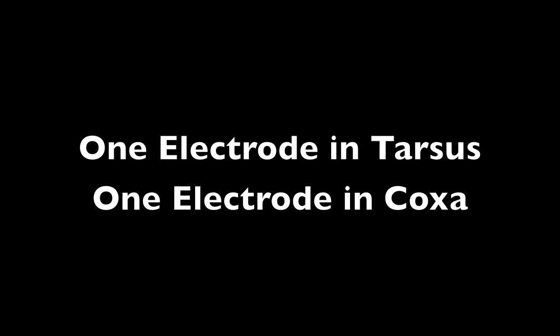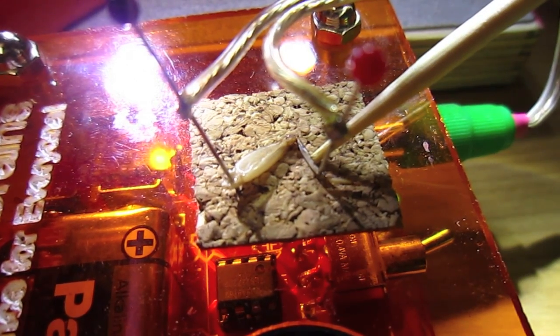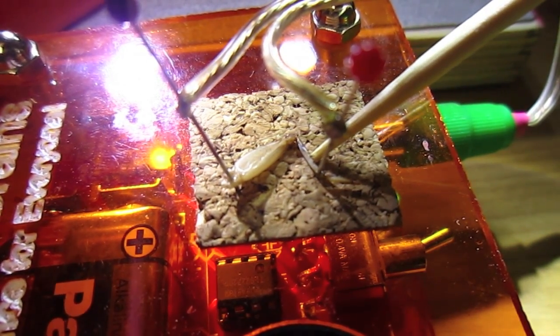And finally, with one electrode in the tarsus and one in the coxa, you have a preparation that is very sensitive to moving the barbs on the tibia and also lightly breathing on the leg.